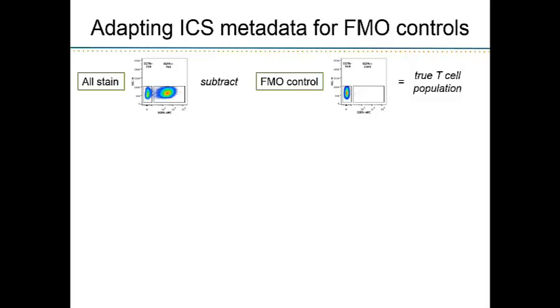Another feature that we use in the FlowJo module that LabKey has is the intracellular cytokine staining. And for those of you who don't know what that is, it's staining different cells and stimulating them, and then having a background control where you're comparing that stimulation to what the cells would normally look like. LabKey had made this for a client, and we don't do this kind of staining, but we do have background controls for our panels, particularly with the modified T cells that we're looking at.